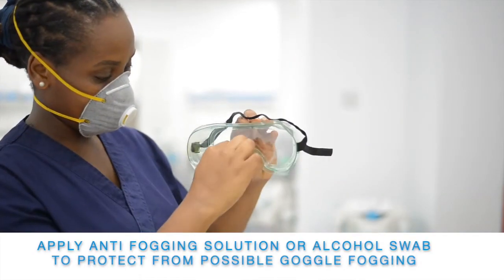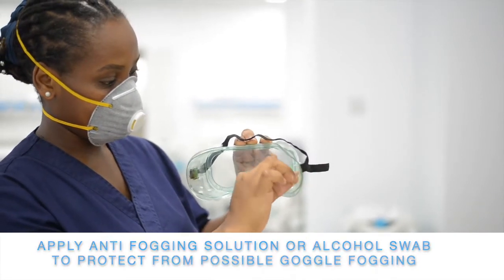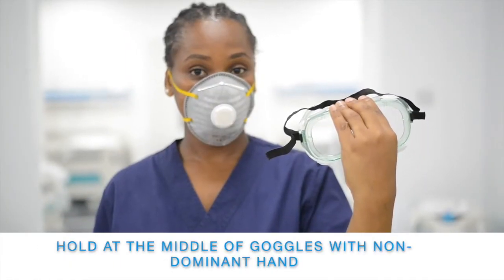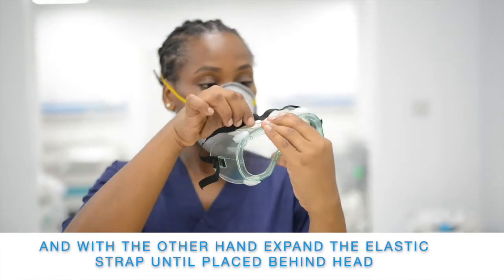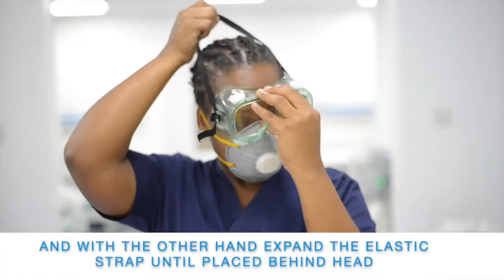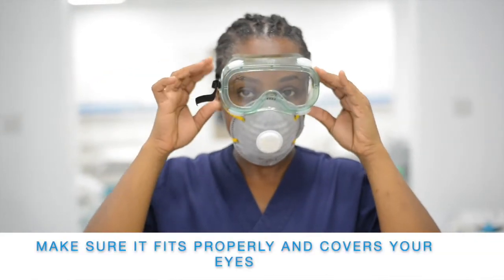Apply anti-fogging solution or an alcohol swab to protect from possible goggle fogging. Hold at the middle of the goggles with a non-dominant hand, and with the other hand, expand the elastic strap until placed behind your head. Make sure it fits properly and covers your eyes.